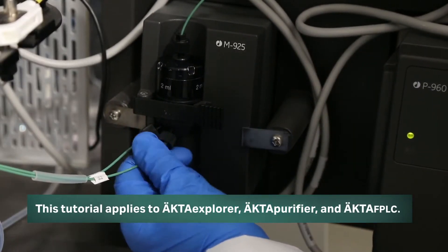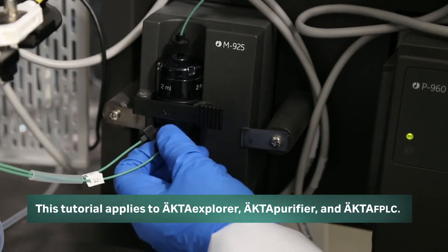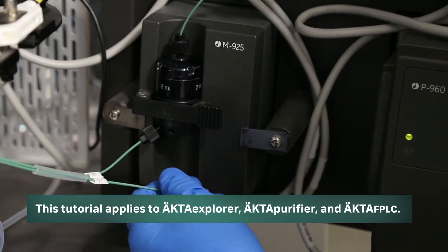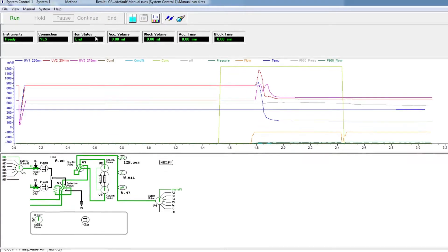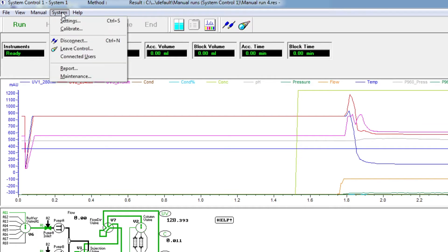Disconnect one of the two pieces of tubing entering the bottom of the mixer chamber. In Unicorn, open the system control window and click on the system tab at the top of the page. Select calibrate from the drop-down menu.